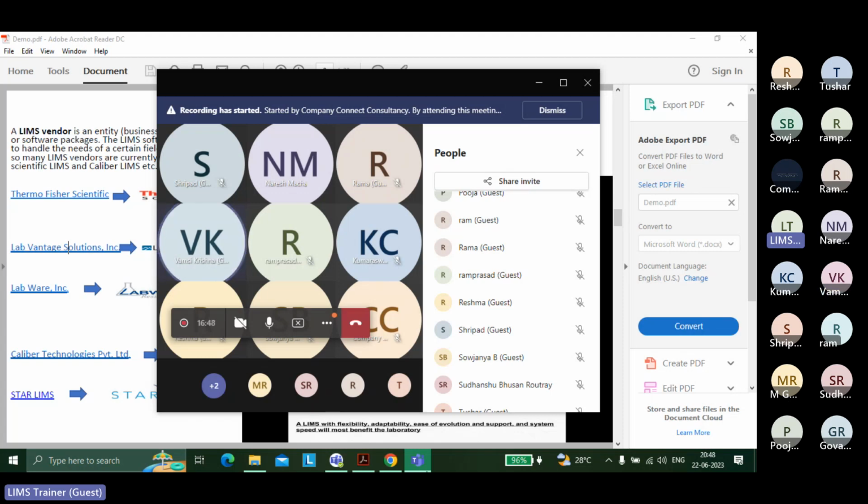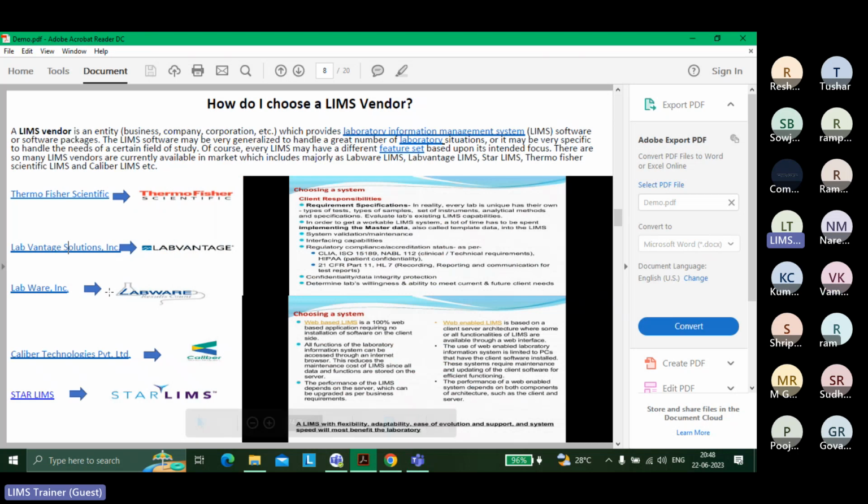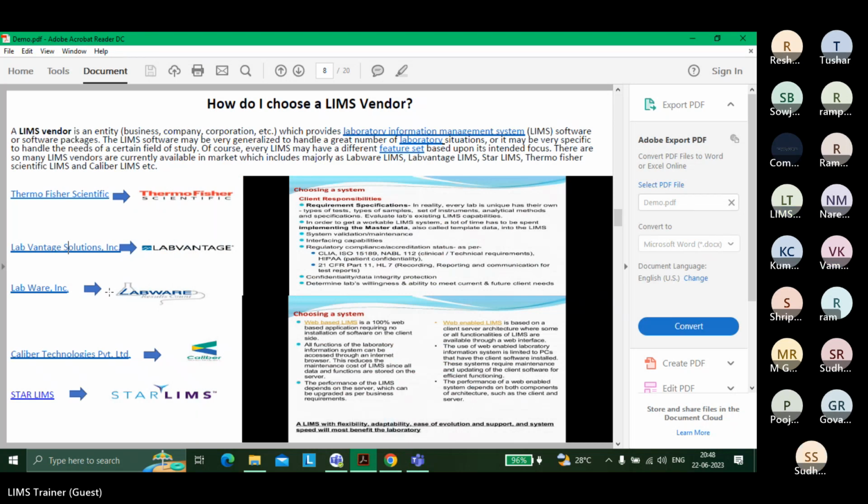Because personally, when working on a LIMS, if this kind of requirement comes, we need to write LIMS basic code, we need some functions to introduce. Absolutely. I'm talking from a QA perception, you are talking from a developer perception. No, you are also correct. I'm just giving the bigger picture.